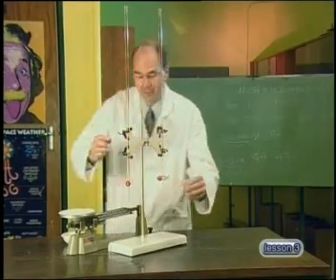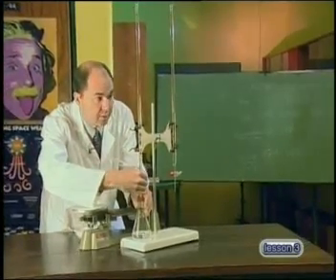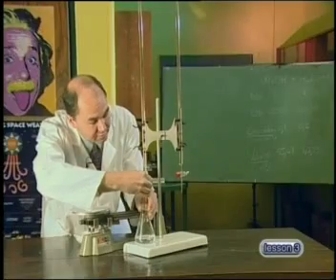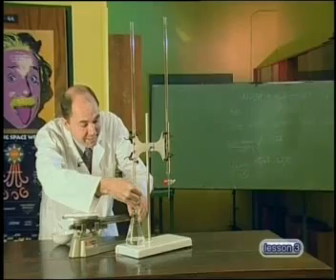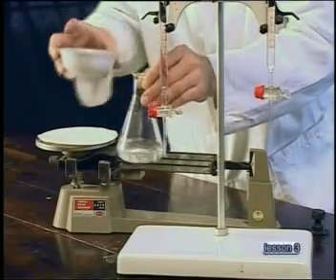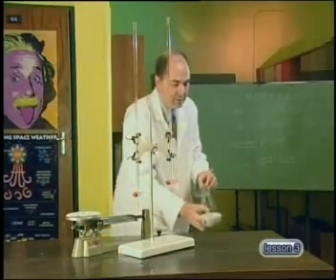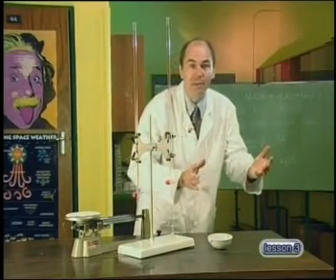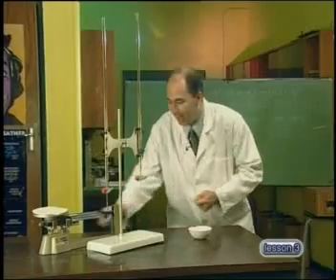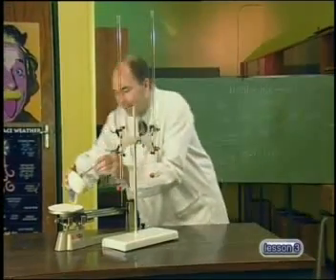Now I need to add the alkali. We need to add 42.73 cm³. We're almost there. Two more drops. And I've done it! We've added exactly the right amount of acid and alkali. I'm now going to take this solution and pour it into an evaporating dish, and leave it for a while so the water can evaporate. The water's all evaporated and I've been left with some wonderful white salt crystals.